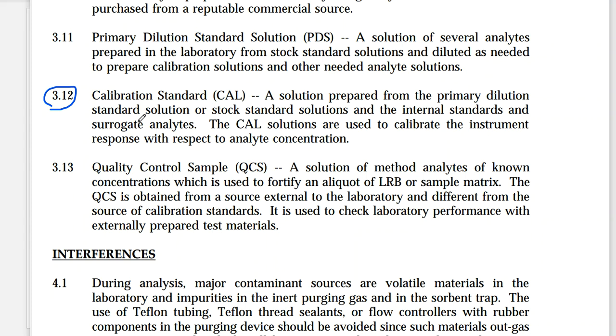The reason I do this is because I just talked about calibration curves and calibration standards in the previous video, and you're probably like, what? What is a calibration curve? I don't know. Well, now is the time to talk about this and talk about the purpose of a calibration, and what is a good calibration and what's a bad calibration.